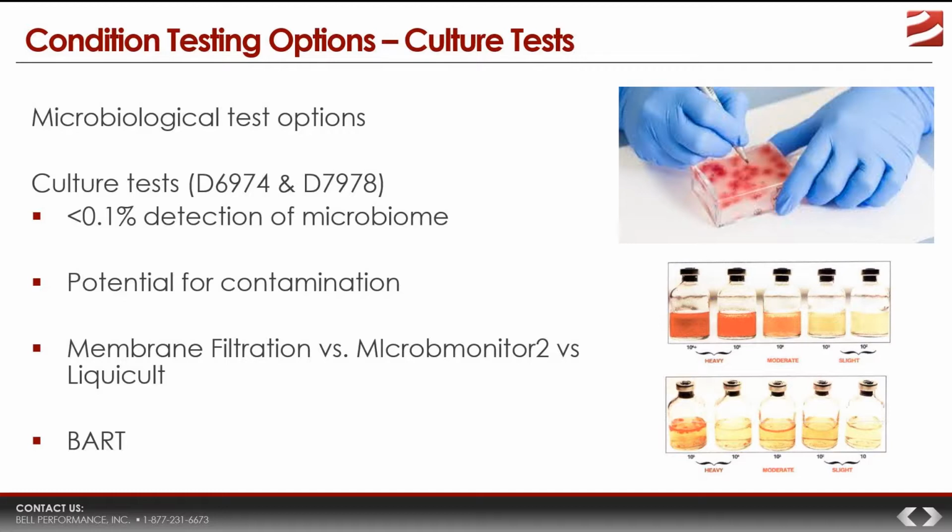Now, remember, you're growing these from scratch, essentially. It takes 30 generations of reproduction for one cell to become 1 billion cells. So we're waiting on these 30 generations to happen while the test is incubating, because it takes an incubation period. That's another one of the disadvantages. You don't get instantaneous results because you have to wait for those results to develop.